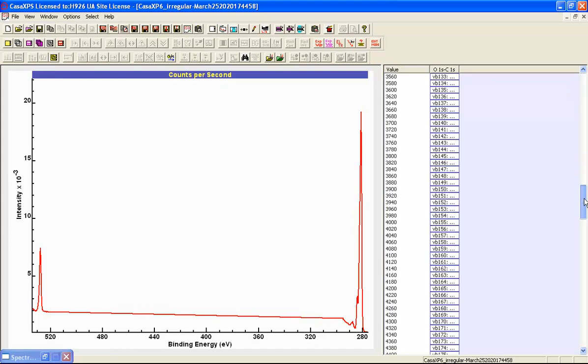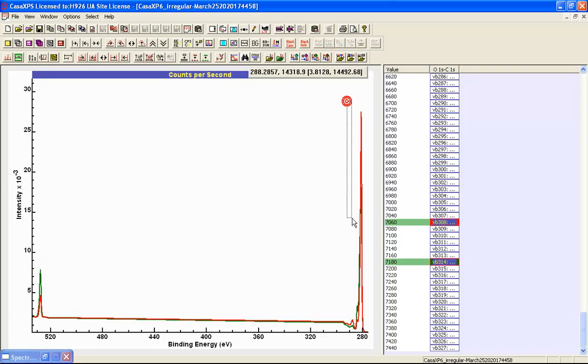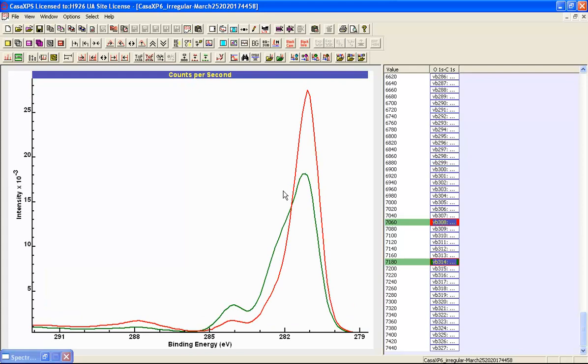When I look at these VAMAS blocks, I'm looking for a pair of VAMAS blocks which actually I've previously identified as being these two, that provide a nice example of where we have a spectrum that contains varying proportions of PS and PVP. And these work out quite well.